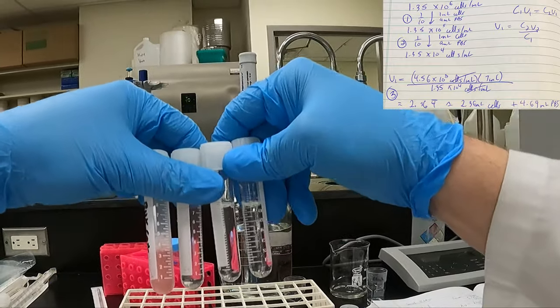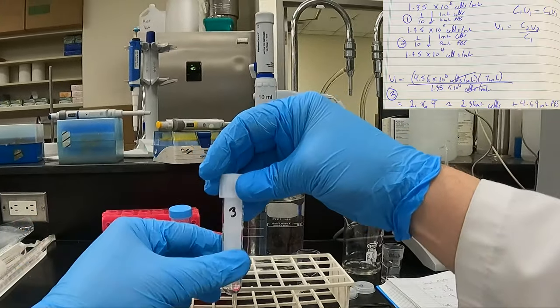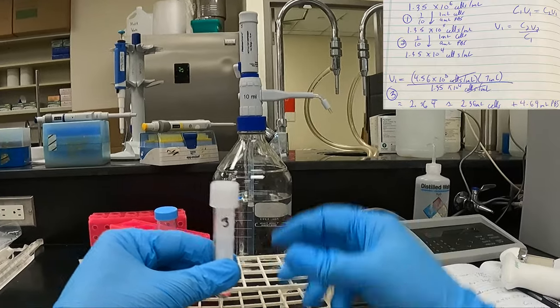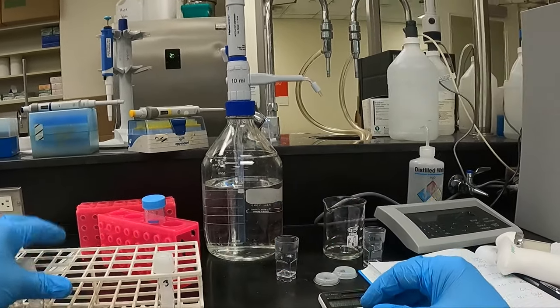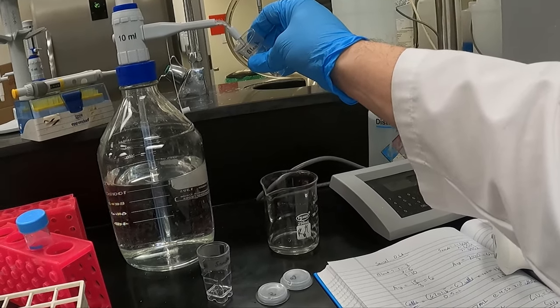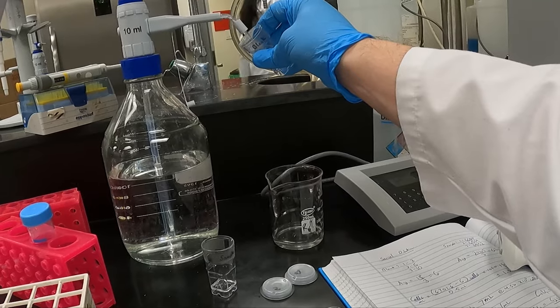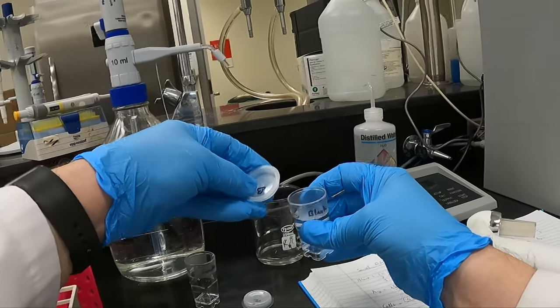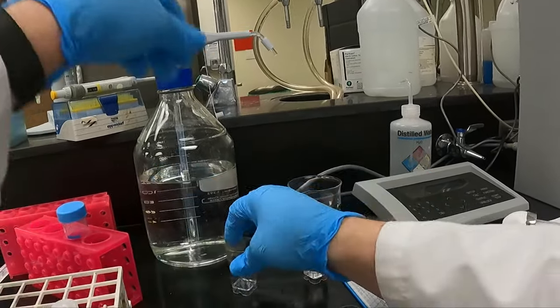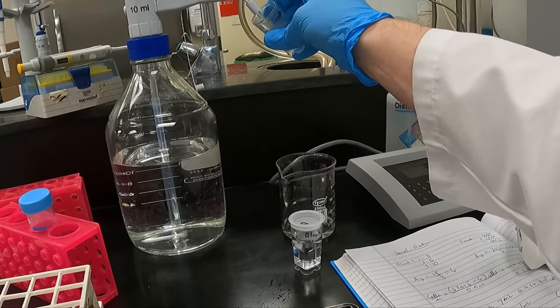If you look at it, you can see a slight progression between them. You don't really see it well in the video, but it goes from very pink down to clear at the end in tube number 3. We're going to count tube number 3. That would be our final dilution. Again, we're going to load 20 mils of our isotone solution into our two cups, one labeled blank and one labeled sample.